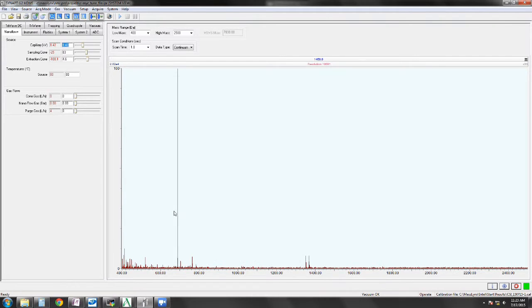This system is a small molecule that forms aggregates. And here we can see a tetramer of 4 molecules. And here we can see an octamer of 8 molecules. We can see how well the sample is spraying by looking here, what we call the shot-to-shot, which is how intense the strongest ion peak is. So here it's about 2.3 to 2.5. We can then alter the settings to try and get the best signal possible.